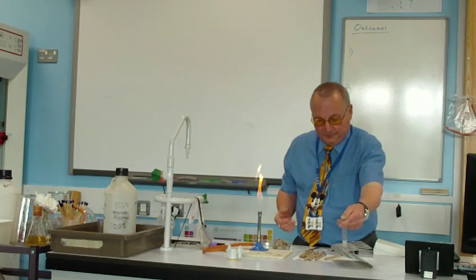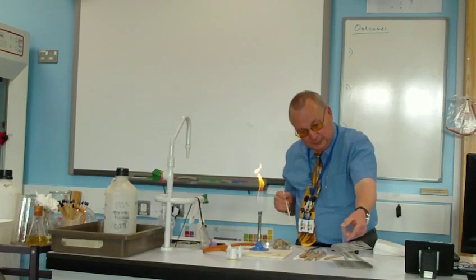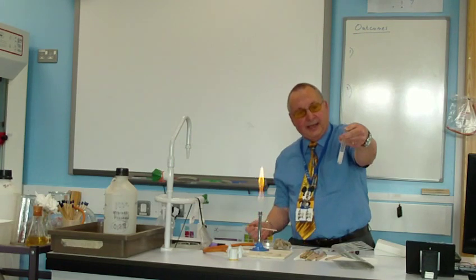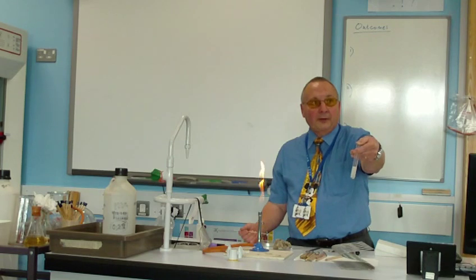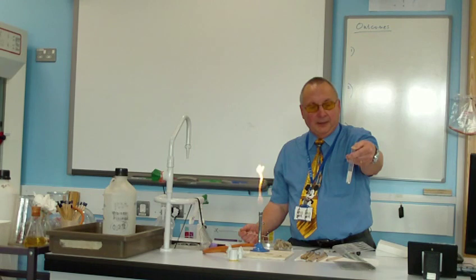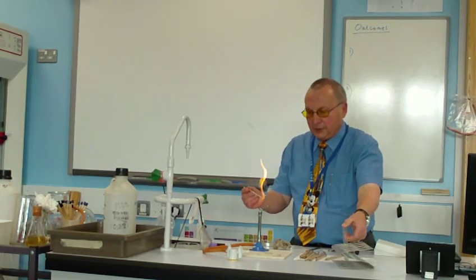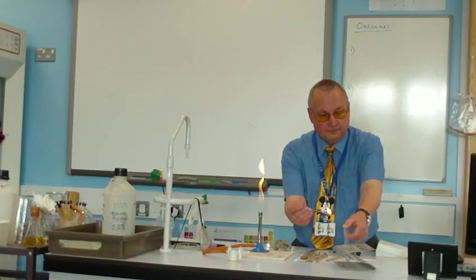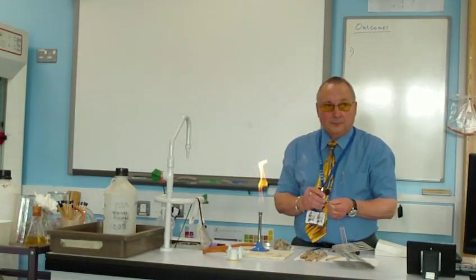Now, one person in the group is trapping the gas. So in there, as it's producing hydrogen, I should have a mixture of hydrogen and what? Not just oxygen, but what's in the air? Air. Hydrogen and air. Now, I don't know if that'll be long enough. If it is, the other person in the group will have a splint. Are you ready? Ooh, cool. Did you hear the pop? Yeah.